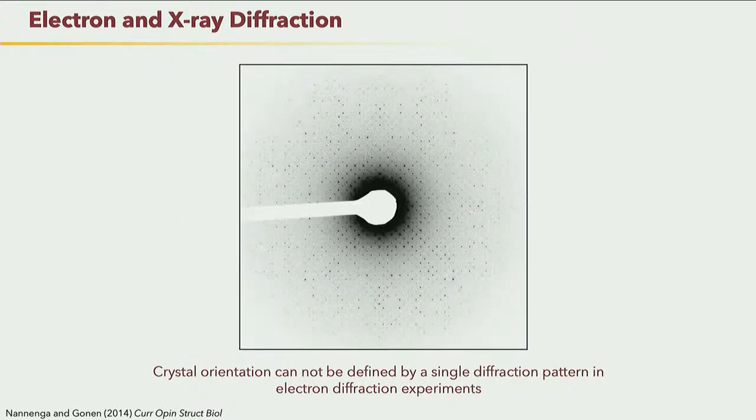this other slide, I'd just like to zoom in here for the crystallographers. While this is not necessarily useful for indexing, it's kind of cool because you can actually see the symmetry. So in this one, we actually caught the 001 plane here. And so you can see your two axes here. You can see the systematic absences showing you've got this screw axis here. So it's pretty, but again, kind of useless if you don't know what your unit cell is.